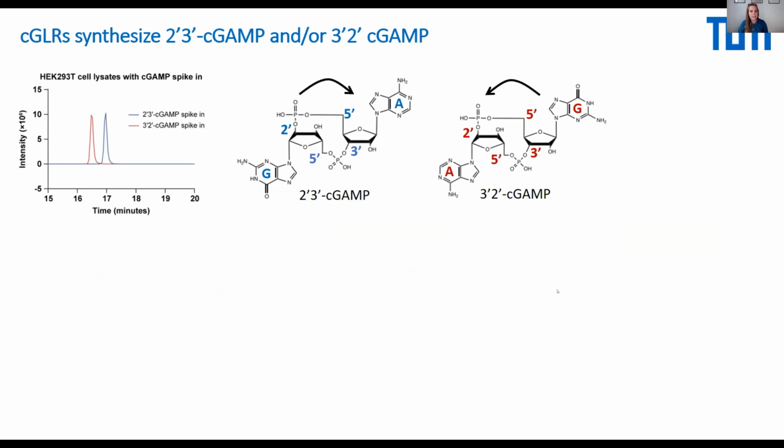So what you see here is based on a human cell system, because that's where we made it work the best. So just don't be confused without fly.